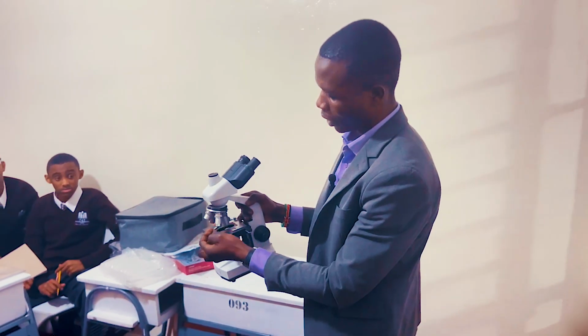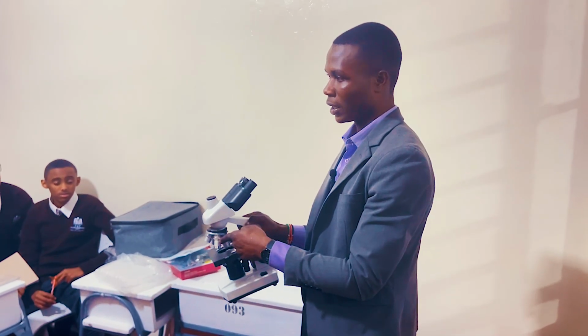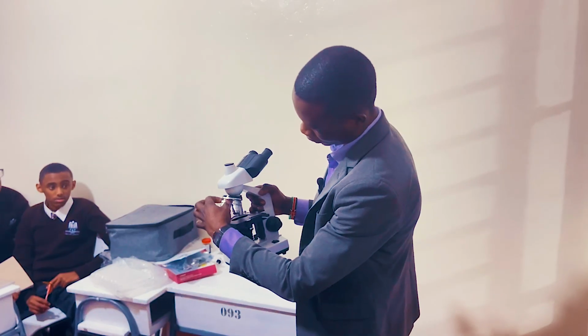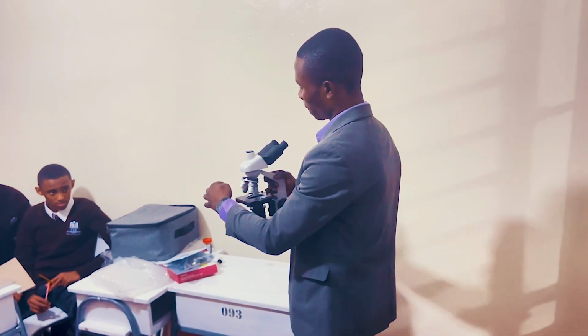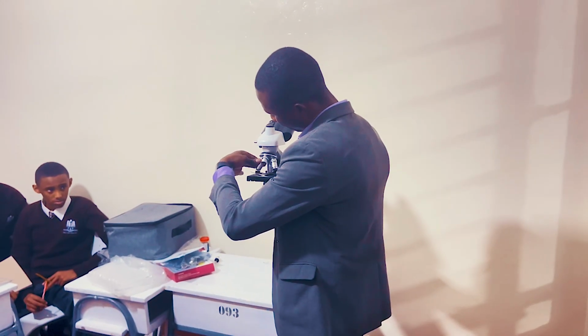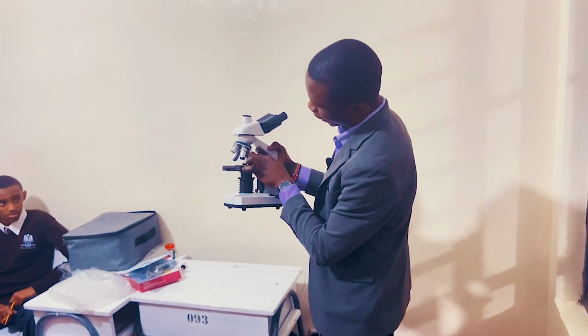If you see, this one is magnification 10. So this one can only magnify an object up to x10. Are we together? If you look at this one, it is 4. It can only magnify up to 4. When you look at this one, it is 100, right? This one can be very big. X100 means it magnifies 100 times its normal size. Then we also have this one inside here, 40.